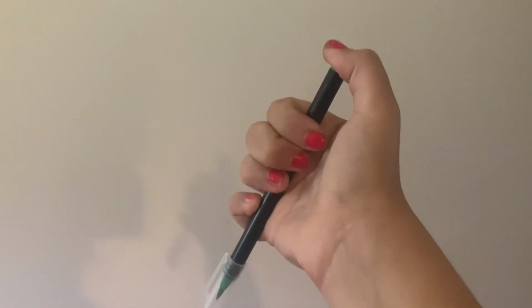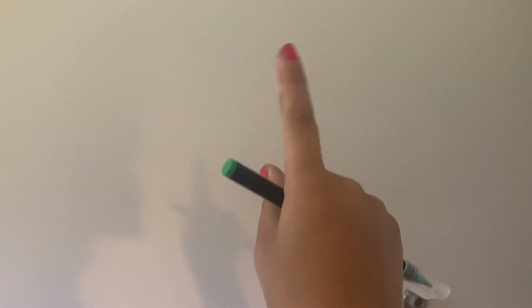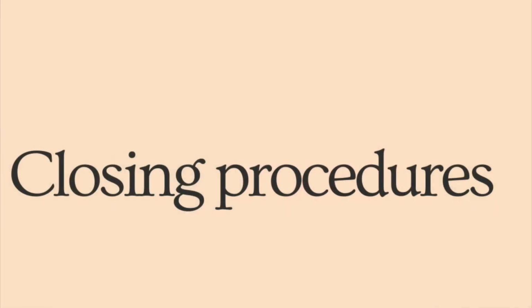Make sure that you do not press to the second stop until your pipette is far away from your liquid. Make sure that you do not turn your pipette upside down. Make sure you do not use the same micropipette tip to draw up a sample twice. So if you accidentally double dip or believe there may be a chance that you have contaminated your sample, make sure you immediately let either your faculty member or a member of the lab staff know.